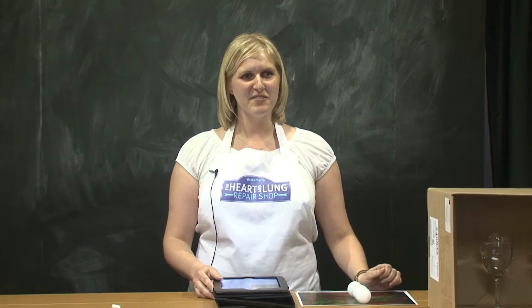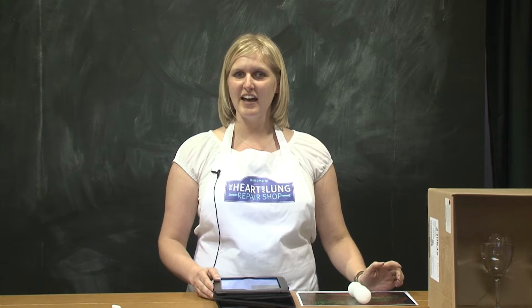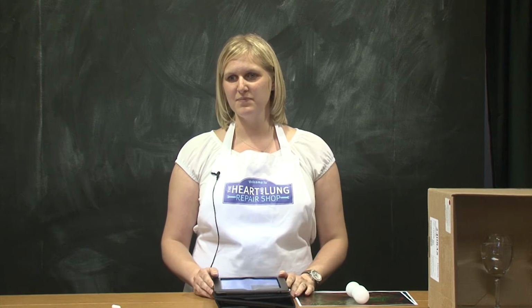Hi, I'm Nicola. I work for the National Heart and Lung Institute, and today I'm going to teach you about fluorescence and explain to you how we use it in the lab.